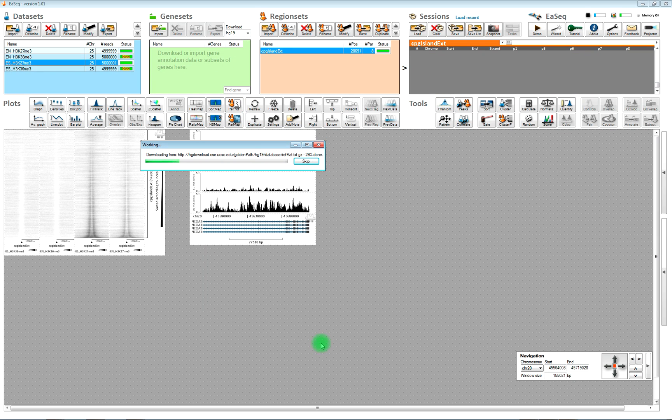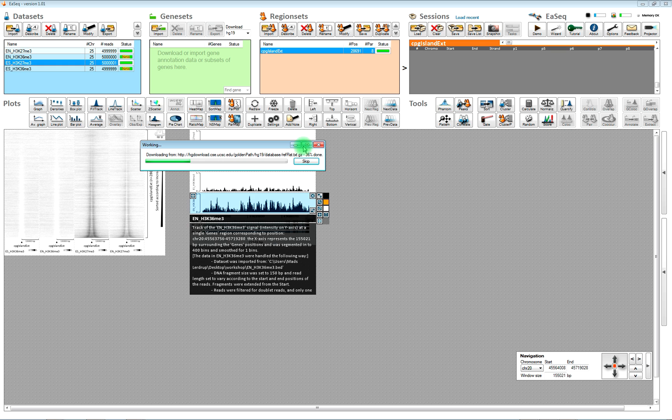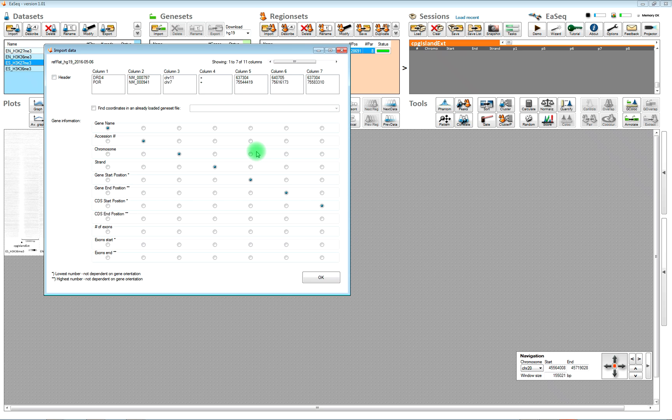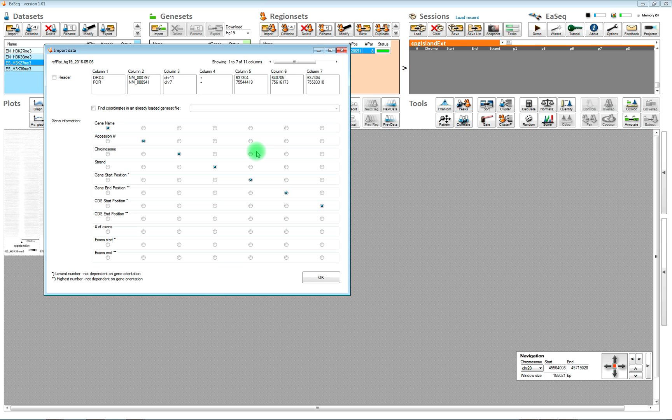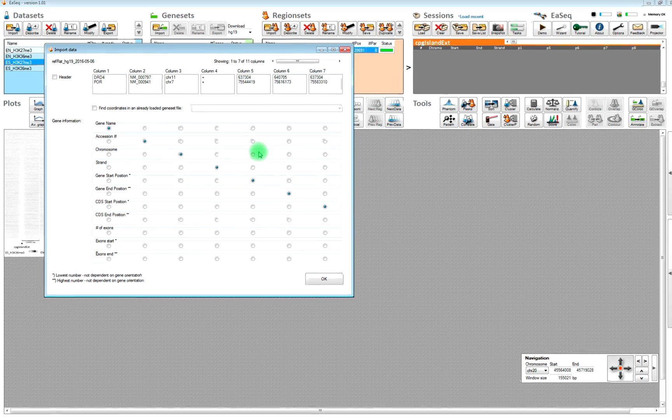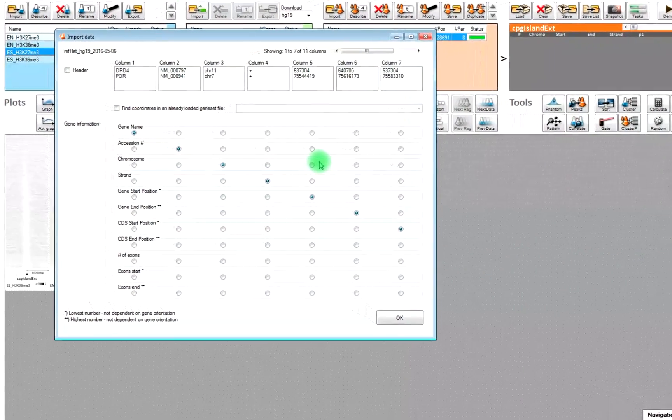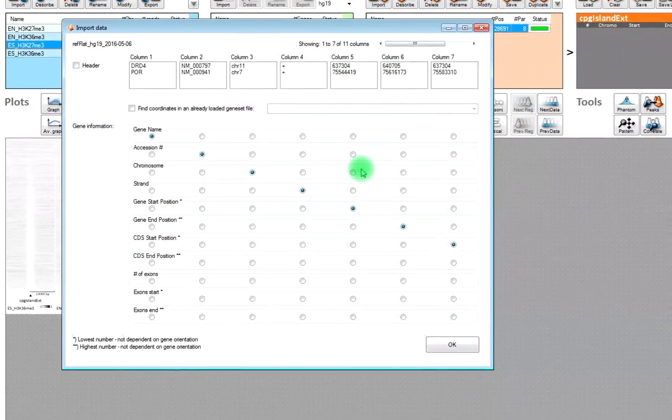You can also instruct EaSeq to download a gene set from UCSC. That is what we are doing now. Now it is downloading hg19, which is one of the reference genomes from the human genome.